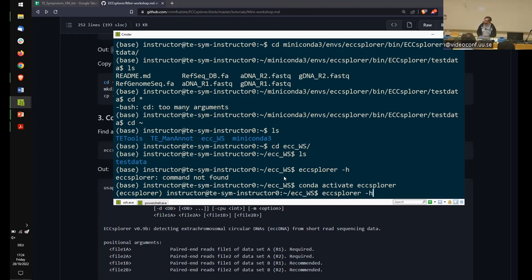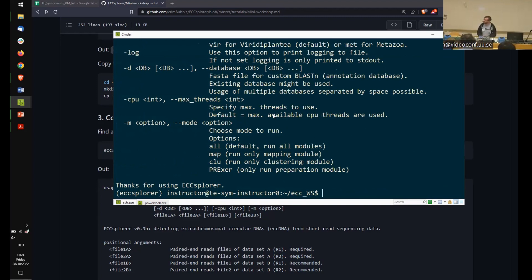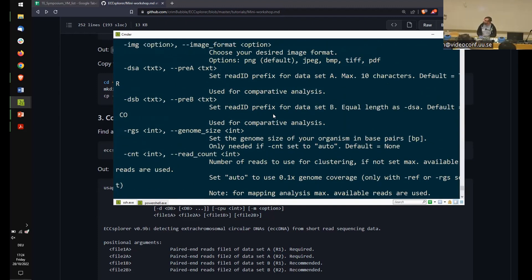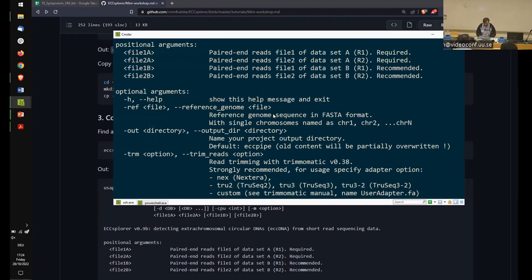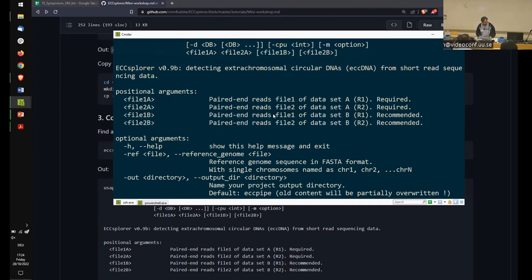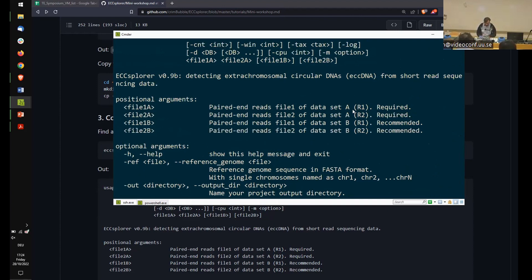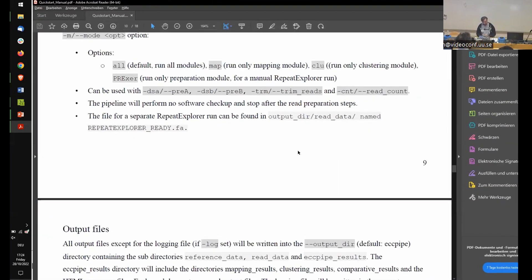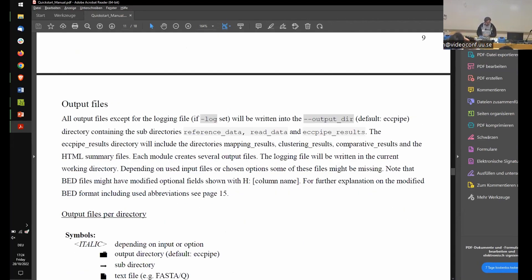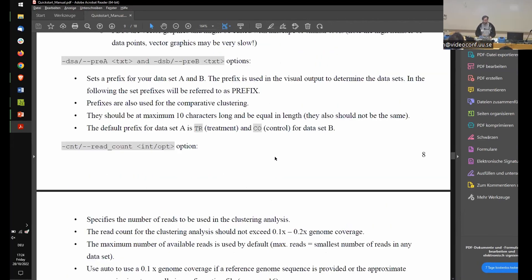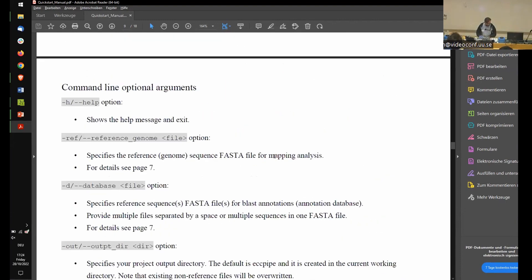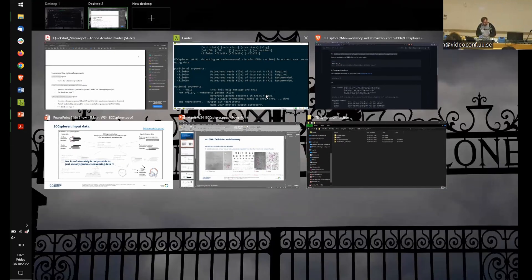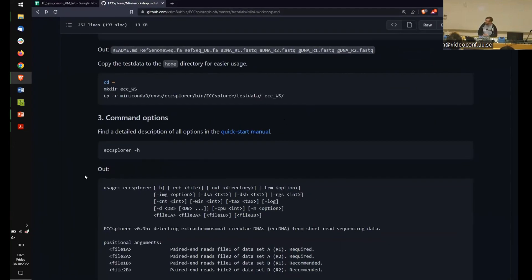Now let's run ECC Explorer with the help flag to see the options. You'll get quite a lot of output — don't be intimidated, we've seen tools with even more options today. The required and recommended input data options appear at the top. For more detail on all parameters, you can check the manual in the GitHub repository — it's downloaded automatically with the pipeline and describes every parameter and what should go in each one.